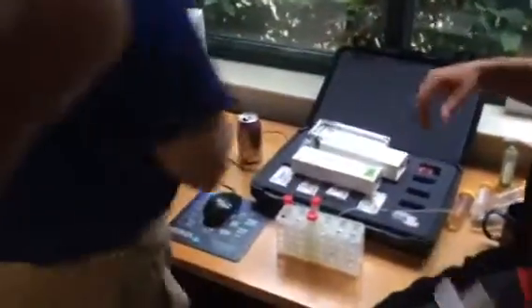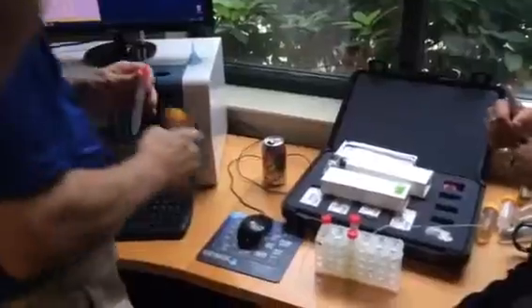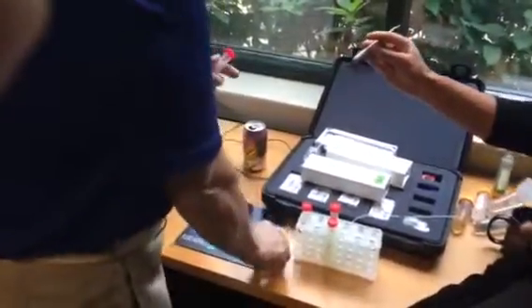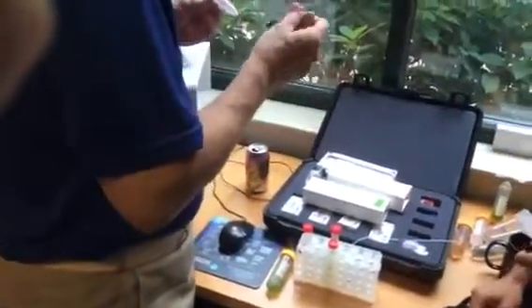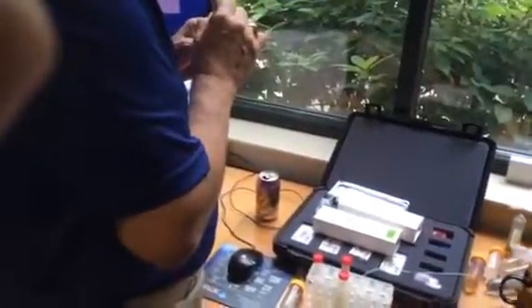All right, so we want to get a new empty test tube, and we're going to do the glorious thing of labeling it. This one is going to be bag C, isn't it still? Yes.